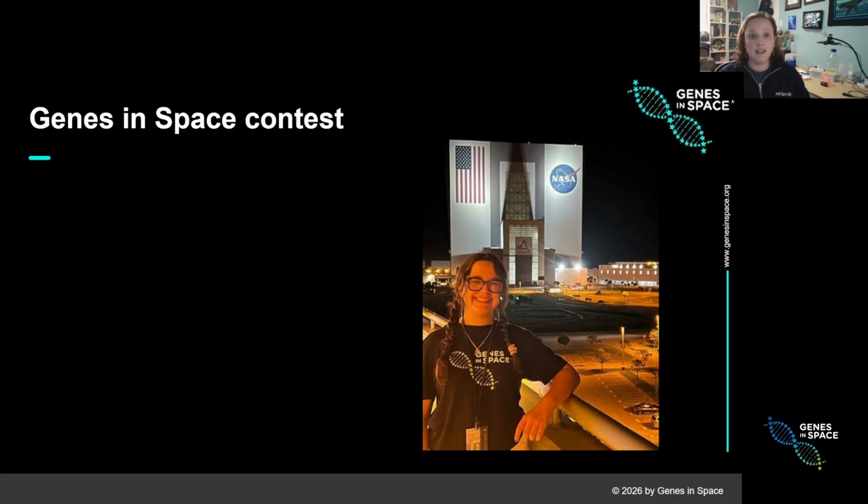The Genes in Space contest gives students a way to share these questions and possibly send their experiment to the ISS. The contest invites students in grades 7 through 12 to write a proposal for an experiment that would test or solve a biological problem related to space. There are only two requirements. First, there must be a genetic target. And second, the experiment has to use a piece or pieces of the Genes in Space toolkit. This is equipment from Mini PCR that are on the ISS specifically for this purpose.